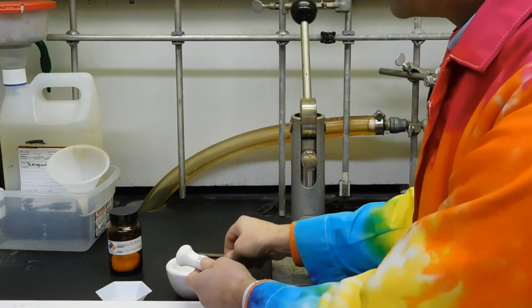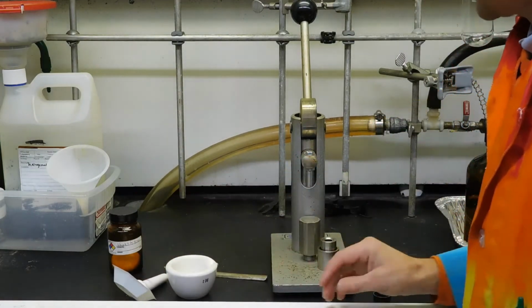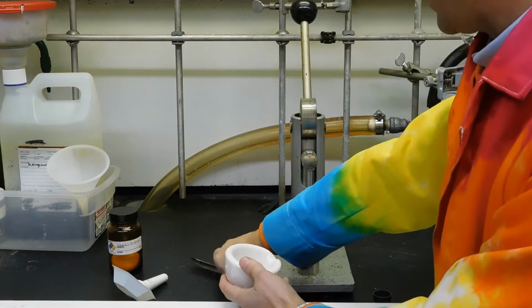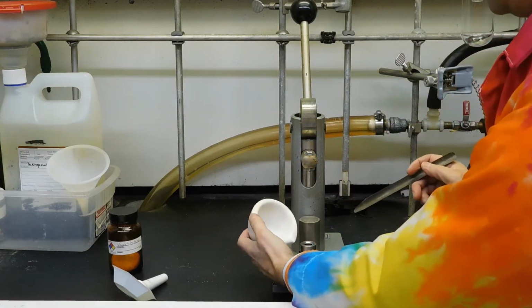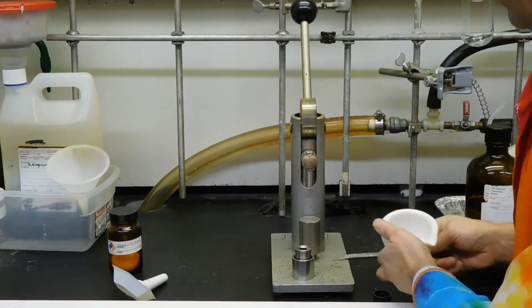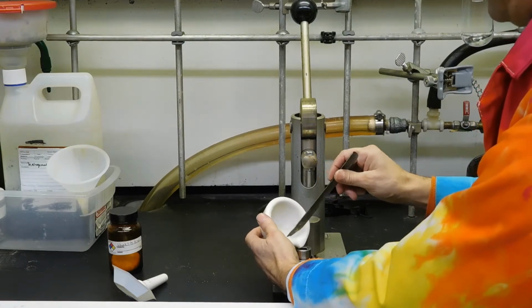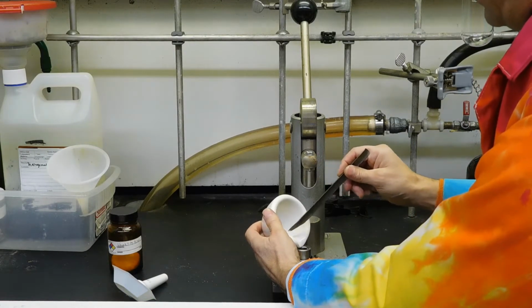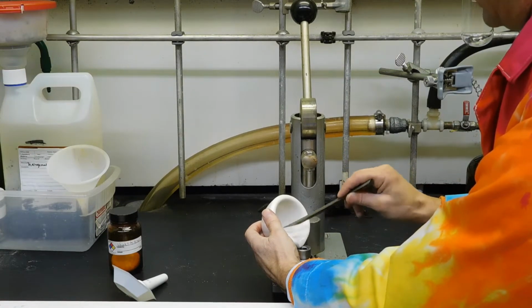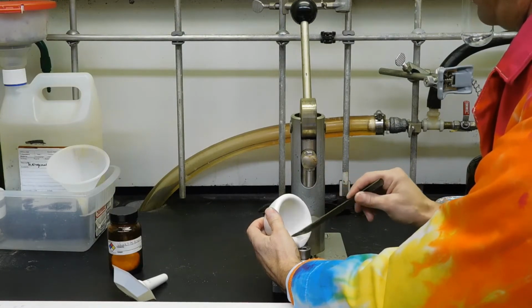So I weighed it ahead of time to make sure I had a little more than 1/2 gram, because I want about 1/2 gram in the end. And then we take the coarse powder that we made and put it into this press cylinder. So as you can imagine, I'm not going to know exactly how much actually gets in here, because some of it sticks to the mortar and pestle, some of it's going to get spilled.